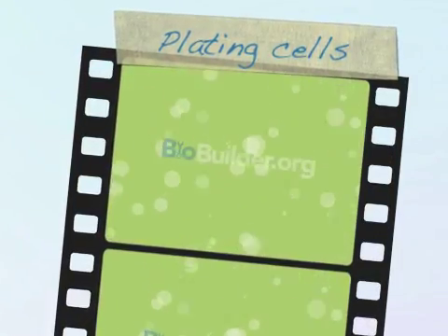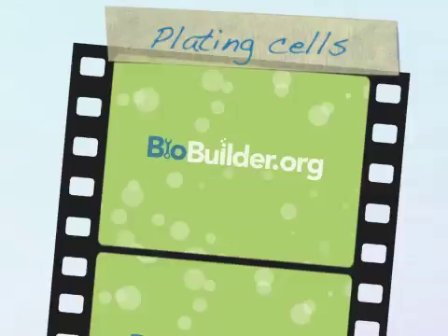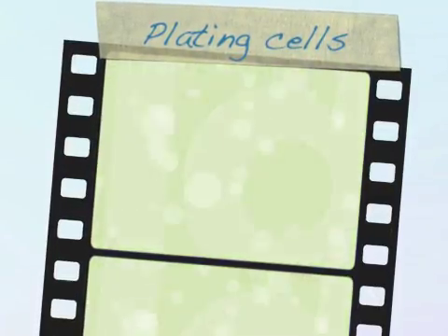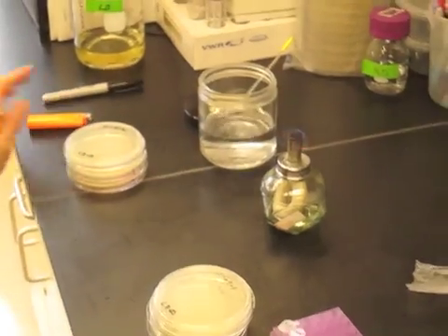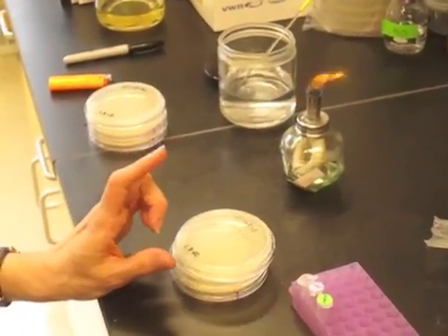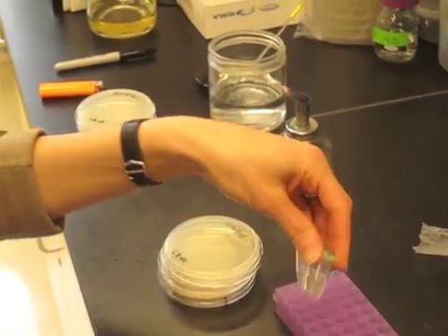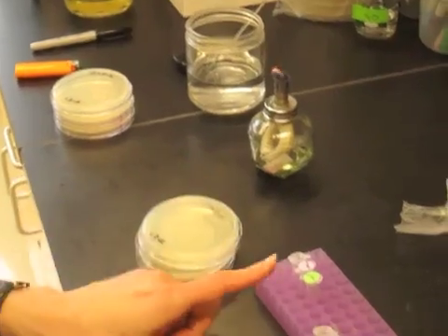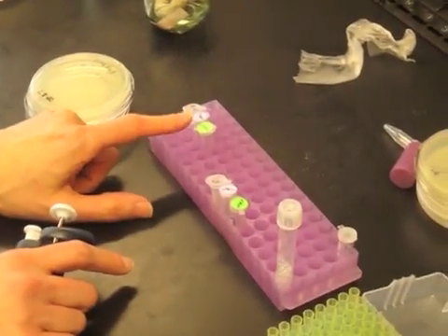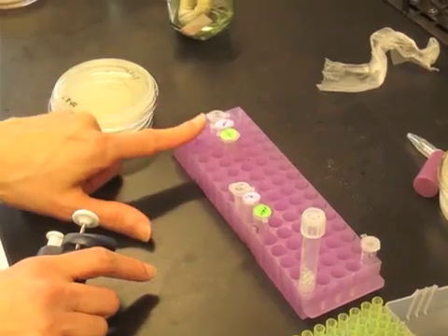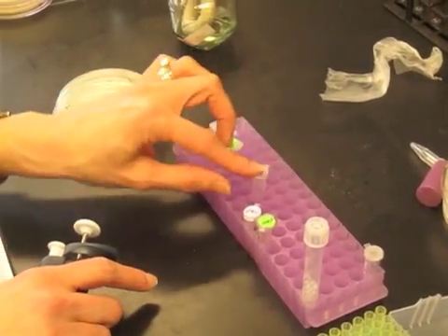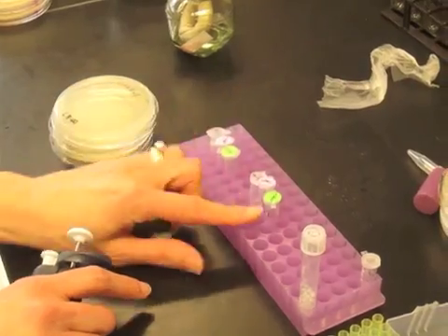Now we've added the LB to the transformations after heat shocking them. We have no DNA plus the two DNAs that went into strain 4-1, and then no DNA plus the two DNA programs that went into strain 4-2.